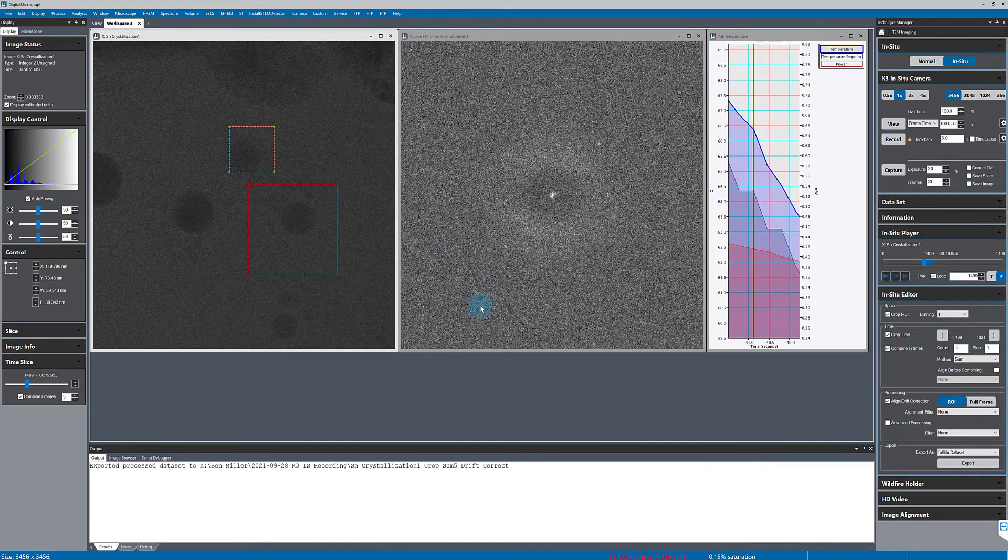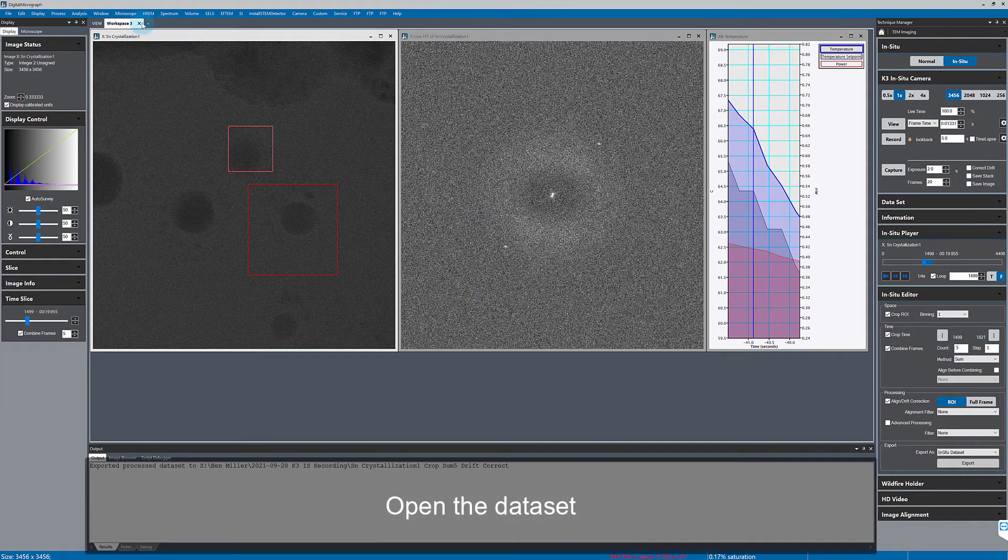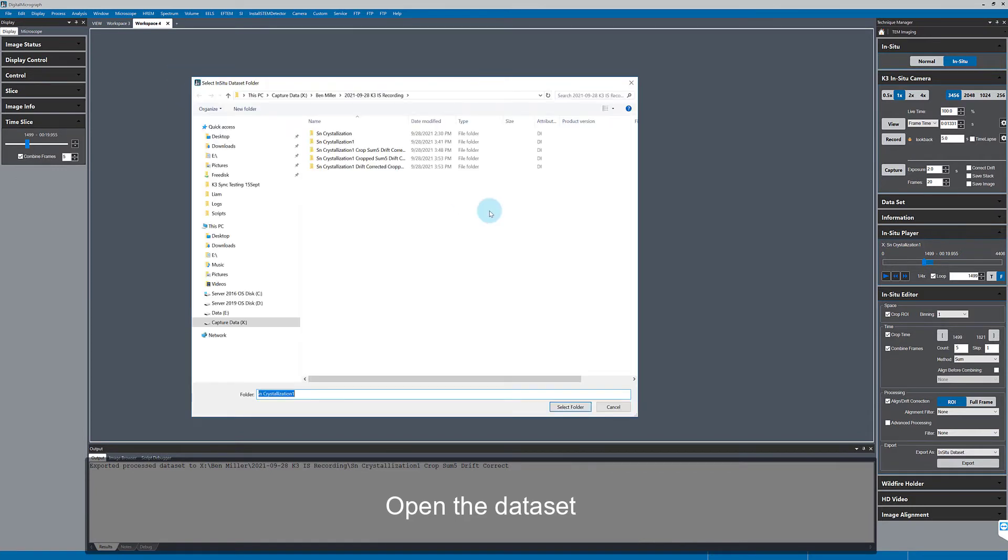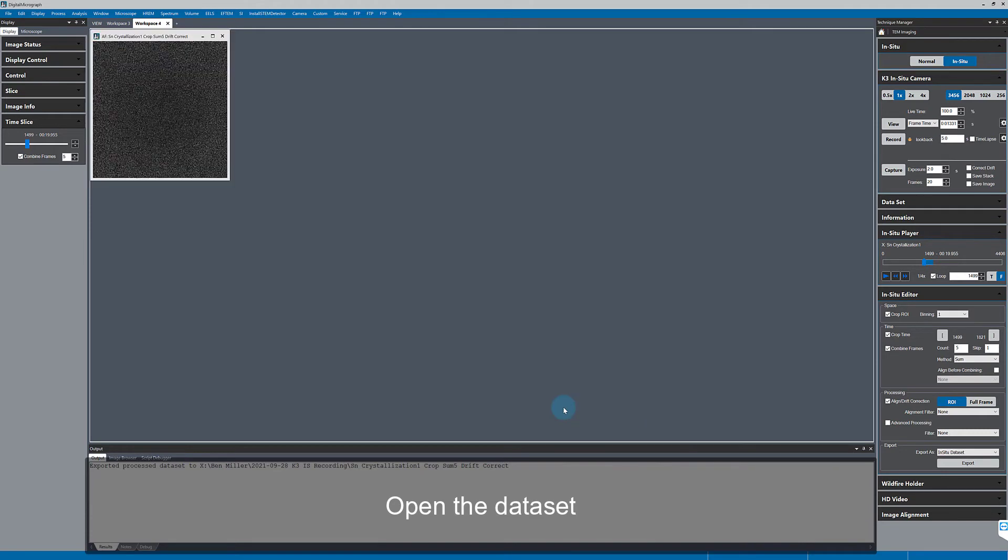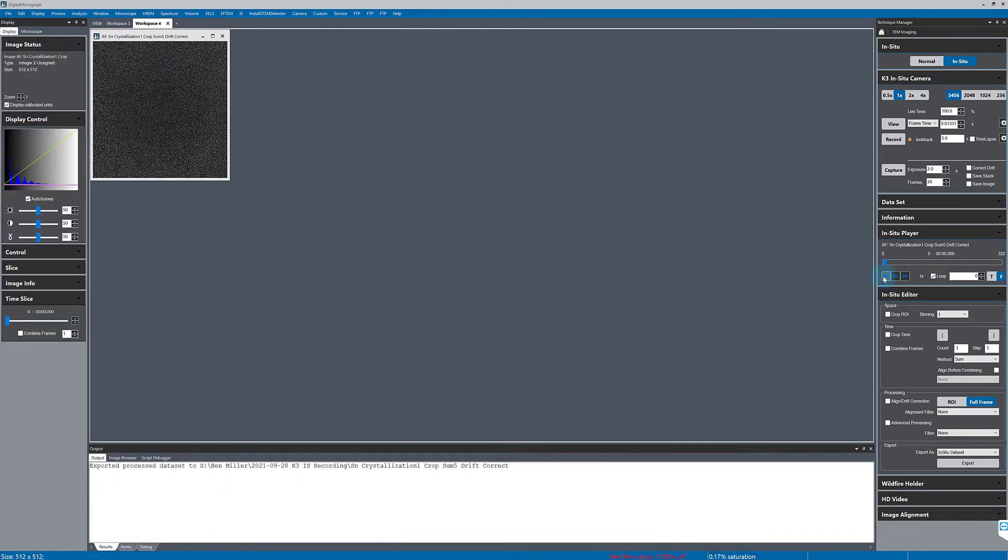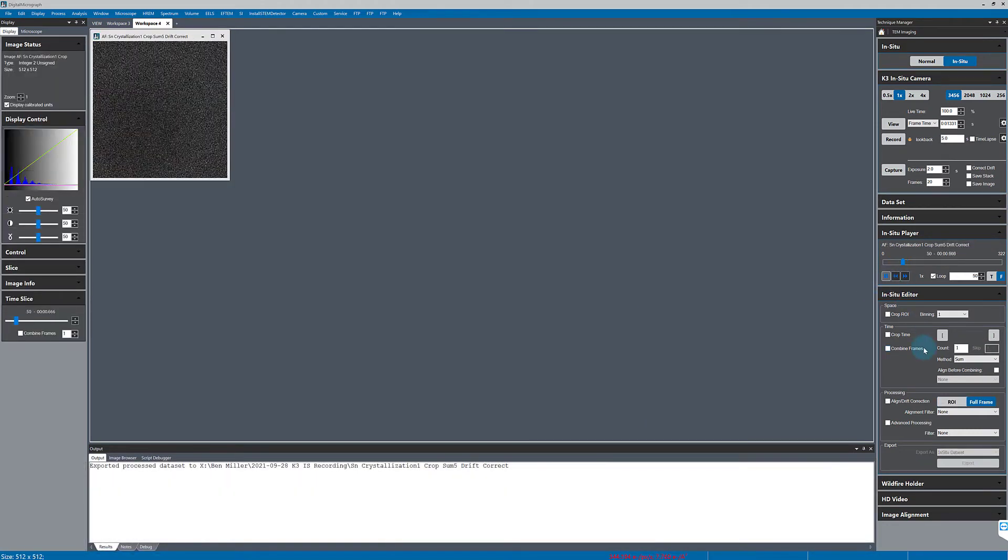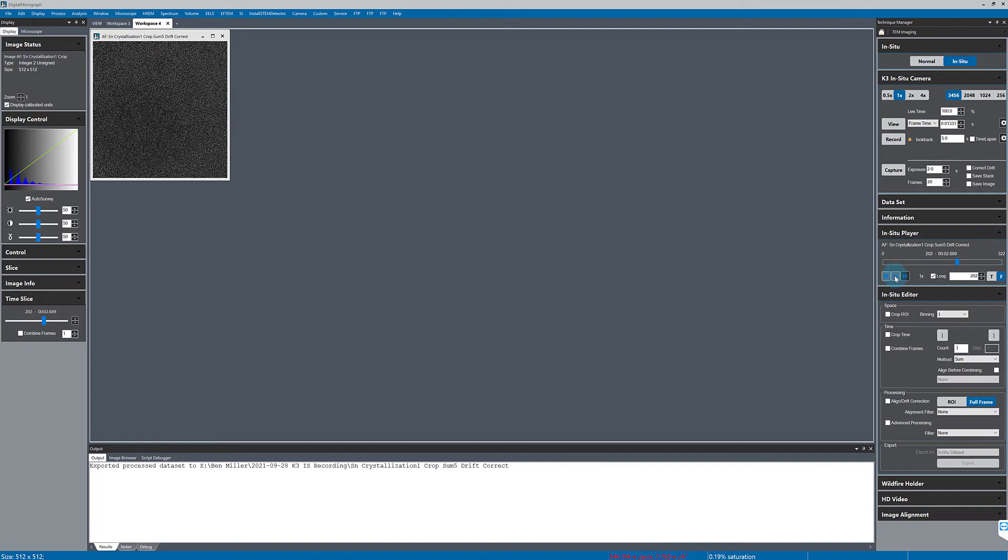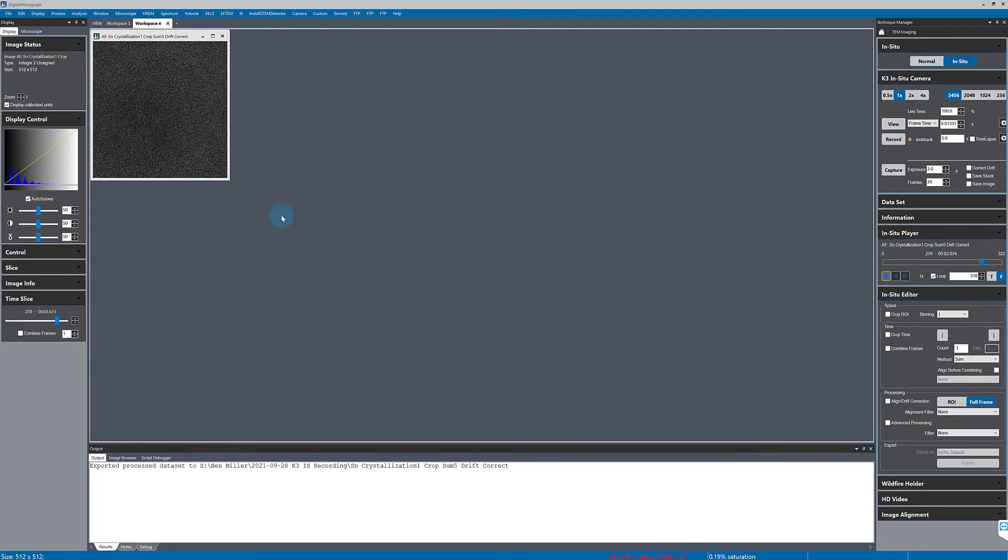Now that that's done processing, I can open the processed data set with GMS. And here's my new crop data set and I can play that back with the same in situ player.